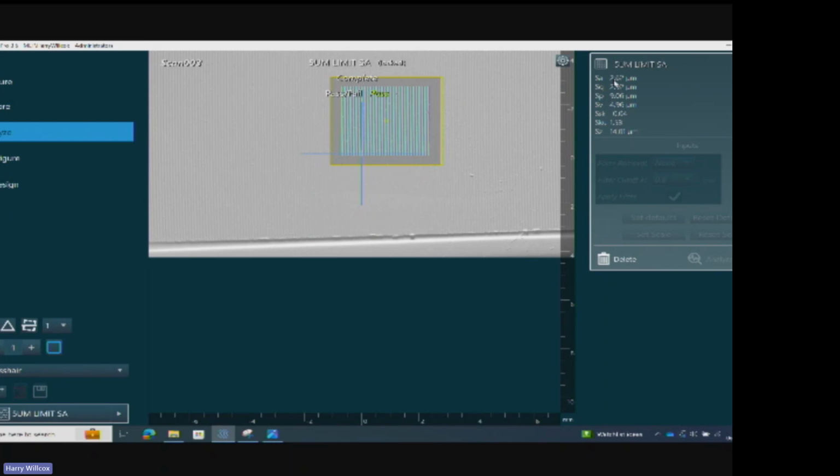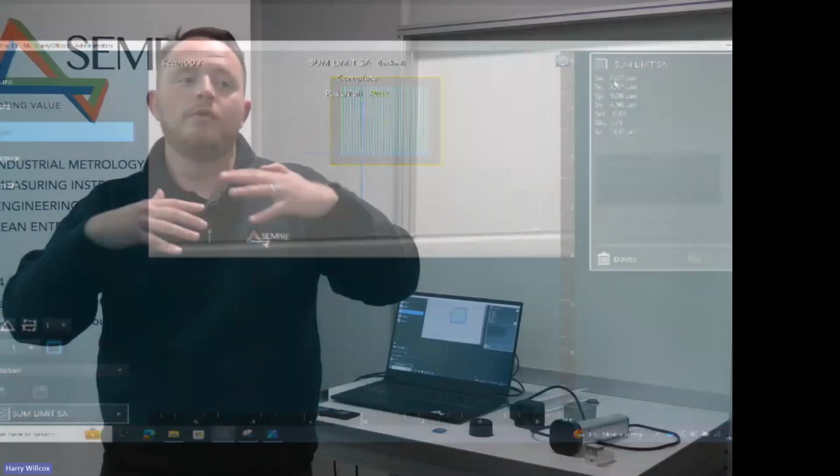I may have missed, but are you able to stitch 2 images together using a reference marker if the field of view needed is larger? Within the Gelsight software, you're unfortunately unable to stitch data together. However, if you had reference markers, you could do that within post-processing software. If you were to look at, say, Polyworks or GeoMagick as an example, we can then bring those 2 STLs together to look at full surface deviation.